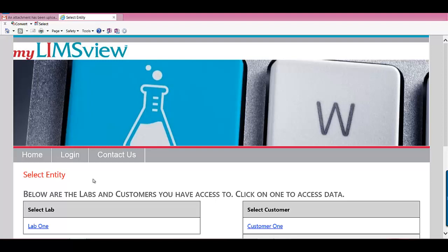Based on our surveys, there are usually two things that customers really want to know: what their sample status is. Have you gotten it? Have you started testing it? Have you completed it? Has it been approved? And is it reported? And can I have my report?